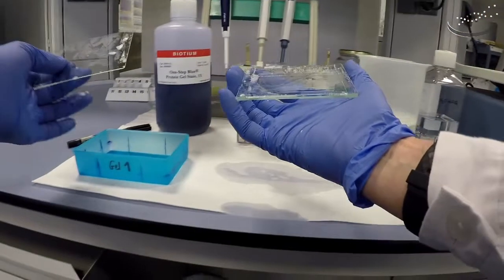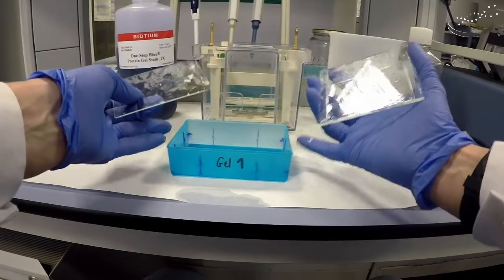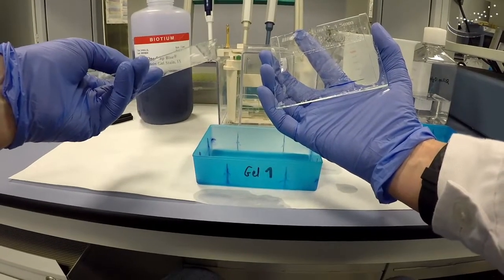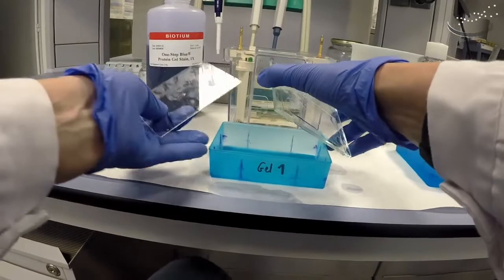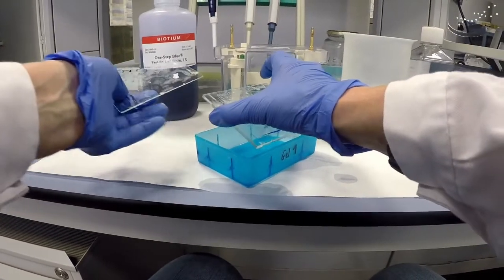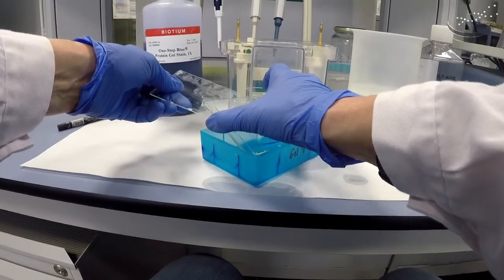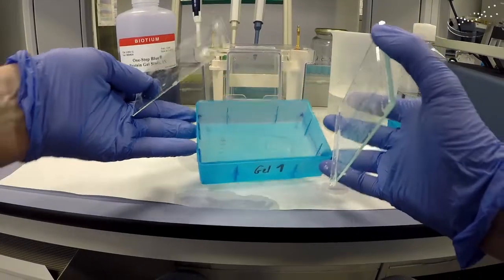Now we want to transfer our resolving gel — where our proteins have been separated — into this plastic box where we're going to do the staining. You can use the green spatula or the small glass plate. We turn the gel over and set it on top of the box, then take the small plate and with the corner go in between the glass plate and the gel and gently pull down until the gel falls into the box. Now the gel is transferred and ready for staining.